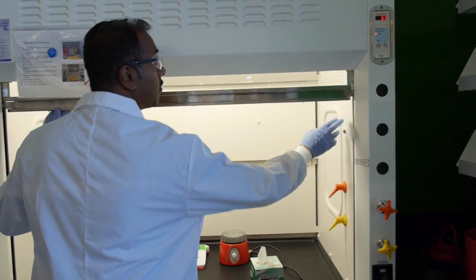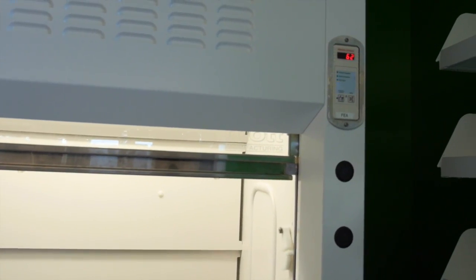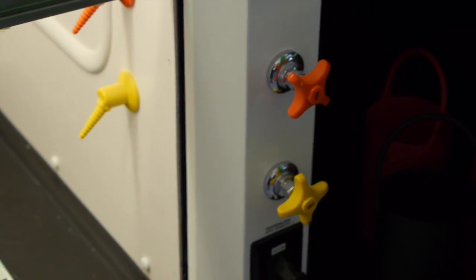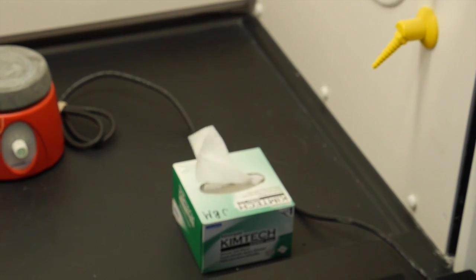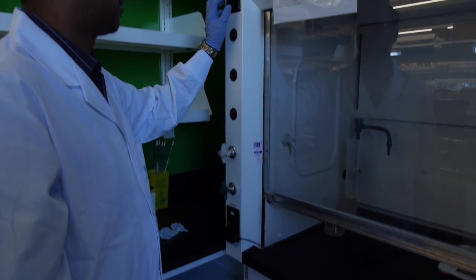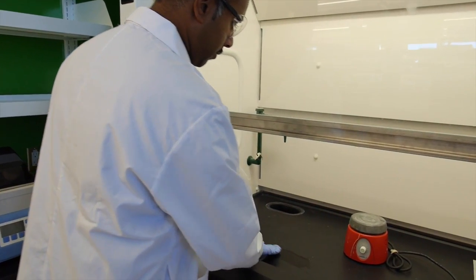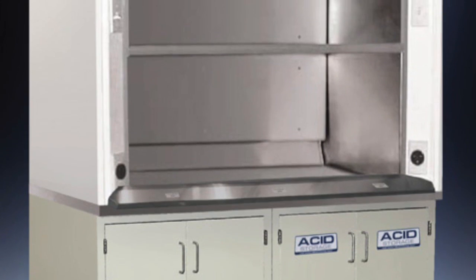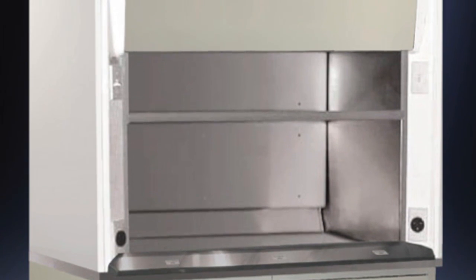Ensure that the airflow monitor and alarm is operational. Check that the controls for services such as water, natural gas, and compressed air are labeled and functional. If available, ensure the general illumination, indicator lights, and associated switches are properly working. Ensure cleaning and proper housekeeping. If using a perchloric fume hood, ensure washdown systems are functioning.